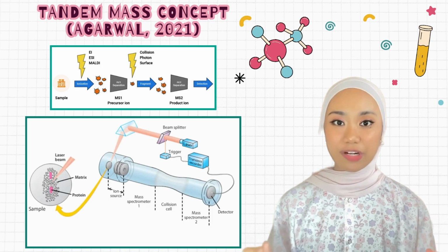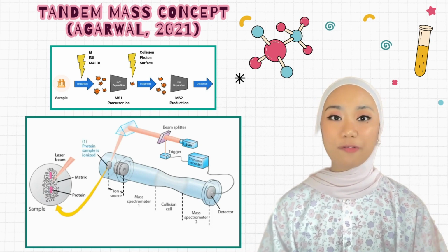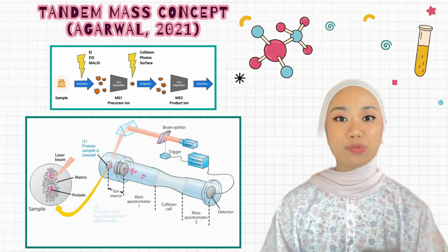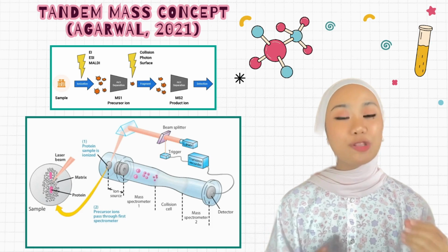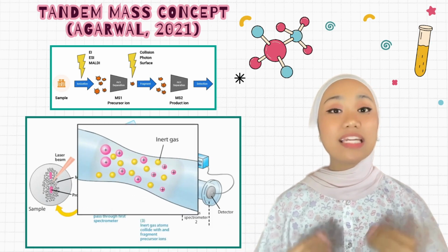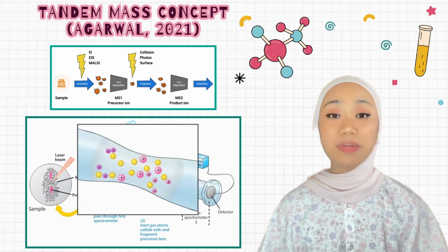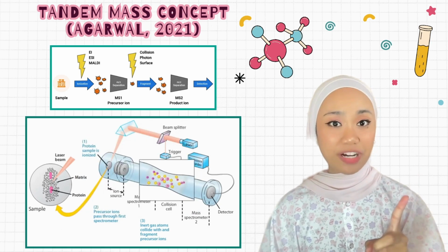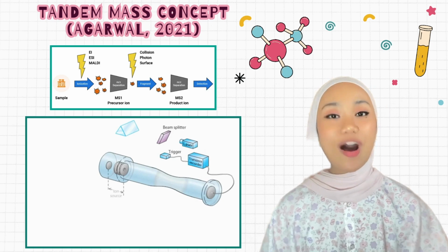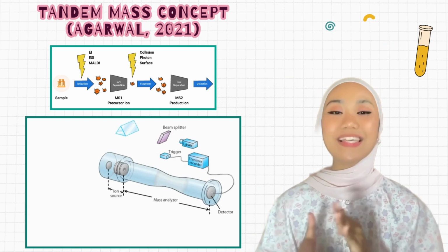These fragmented ions will now move into a mass analyzer such as a TOF, time of flight, which separates these product ions. These product ions will now move into a detector to generate an MS spectrum. When analyzing an unknown protein, the MS spectrum contains many overlapping fragments, making it hard to determine the protein sequence. However, each protein has its distinct spectral pattern. Therefore, analysis software will compare the pattern to a database sequence.